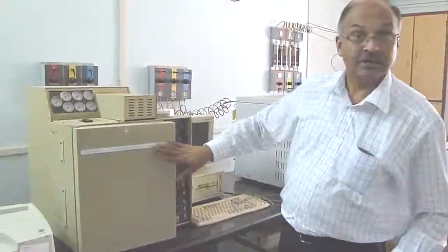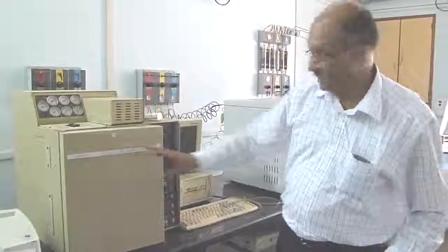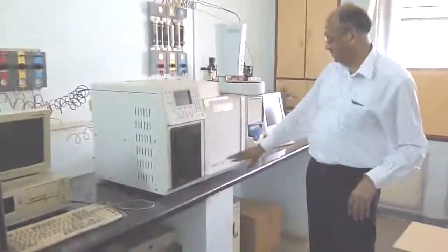This is a gas chromatograph of the company Chemito, whereas this is a gas chromatograph of the company Varian.